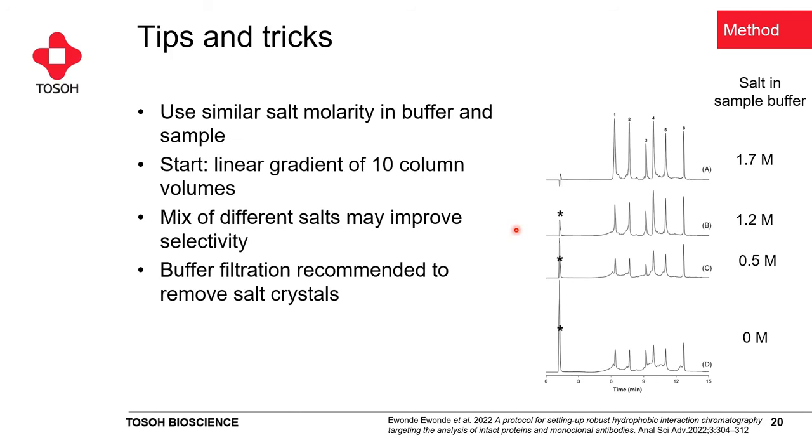Of course, we are using high salt concentrations, so it's important to also have a look at your HPLC system. You should regularly flush it and clean it when working with such high salt concentrations. And one thing you should also keep in mind is that you don't want any salt crystals or precipitates to block your system, so it really makes sense to filter your buffer before attaching it to the system.